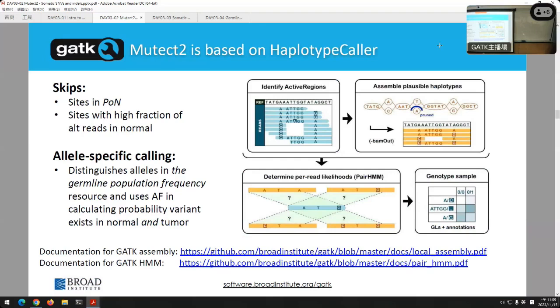But when we toss things first and we're getting down to actually calling them, we have different modes of operation when we're processing tumor cells, what we believe to be the tumor samples, versus the germline ones. We actually have a very high statistical threshold for what we'll use to call a variant on the somatic side. For instance, the filtering is very strict. The mapping quality has got to be greater than or equal to 20. That's a higher threshold we have.